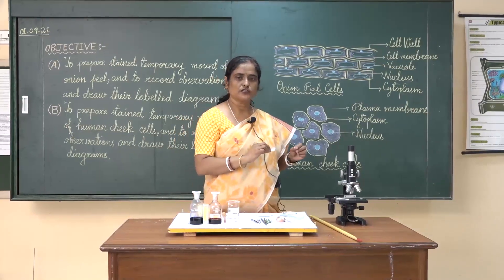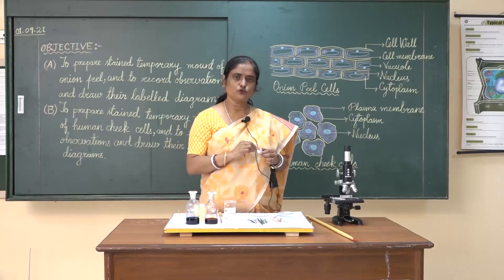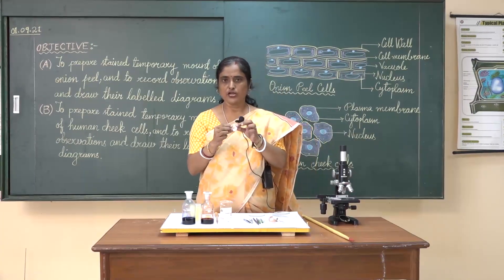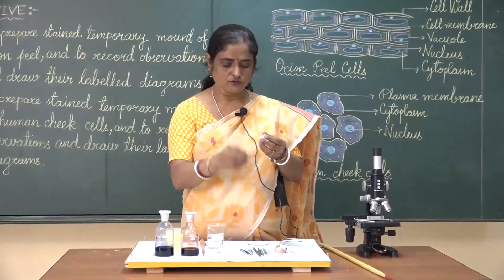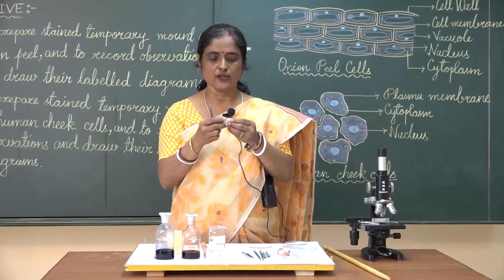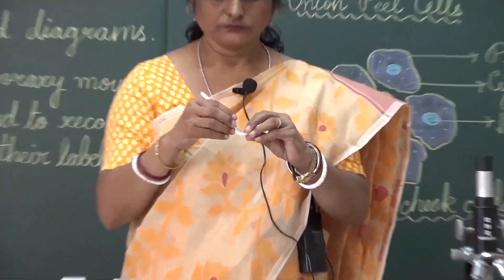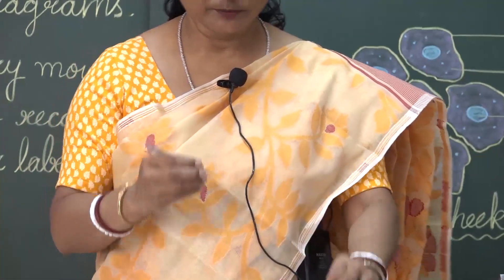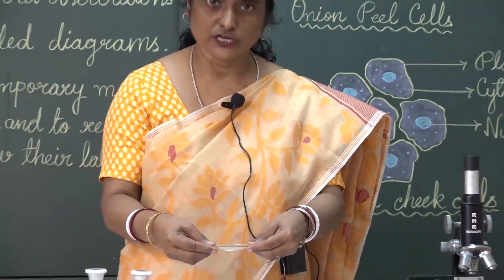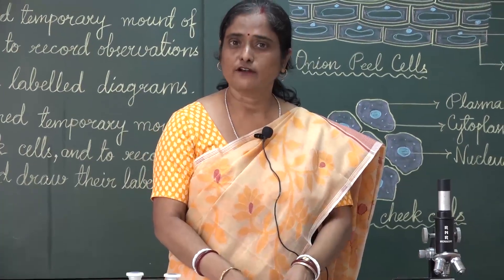The specimen we put under the microscope should be quite thin. So we take a peel of the onion. This is the onion scale leaf and we can take out the peel from inside just by breaking it. You can break it this way or that way and then take a peel. Take the peel and put it in the watch glass which has water, so that it does not get dry.